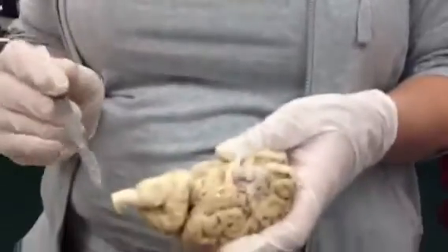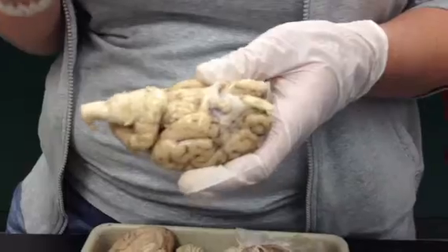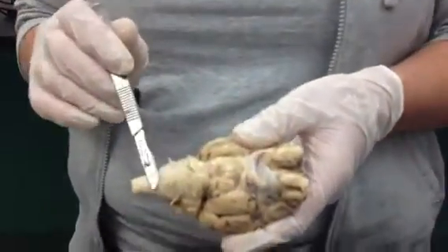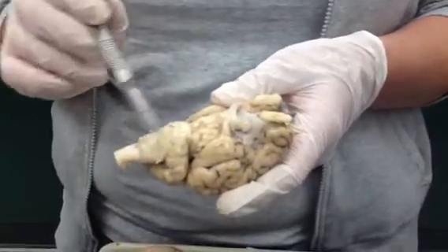And then what structure is this? The spinal cord. Spinal cord. You always want to say brainstem. I don't know why, but you do. Yeah, you know. Spinal cord. What is this? The medulla oblongata. Medulla oblongata. And then what's this one? Pons. What is all this together, Ryan? The brainstem.